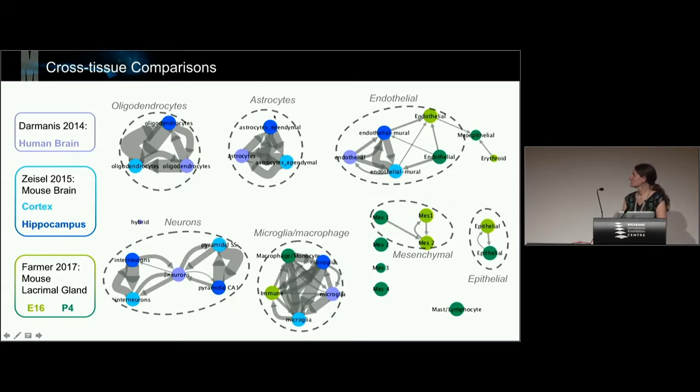And you can see there are these cliques with the astrocytes. You've got an epithelial group over here, neurons with the 2-to-1 mapping. And so that's all very nice. You've also got things like this, which has one of each. And those are microglia and macrophages. So immune cells, and biologically speaking, they're actually quite similar. They're based in different tissues, so that's really nice to see.